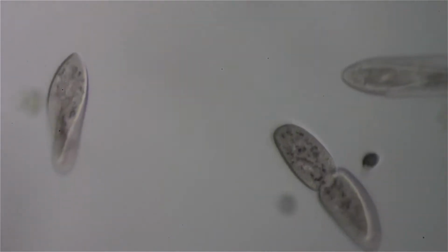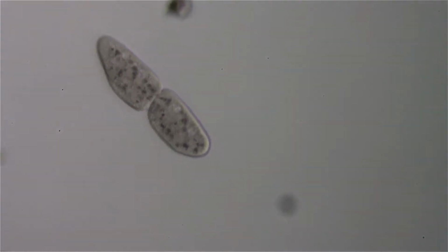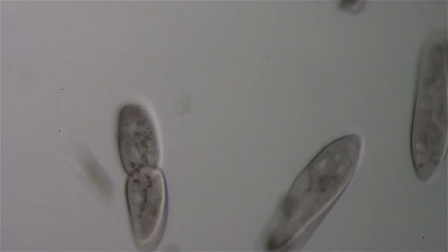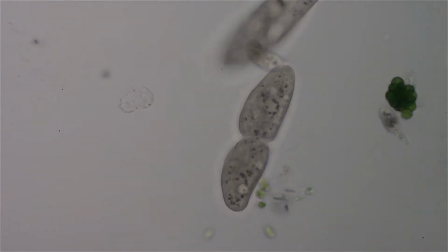However, the secondary interest is these teardrop shaped guys you see in this video. And it turns out they're called Khawkinea, if that's how you pronounce it. And there's a Paramecia all going off at the top there. There's one of them on the right at the top, out of focus. There he is.